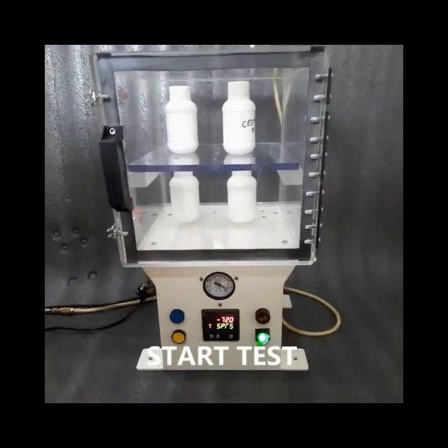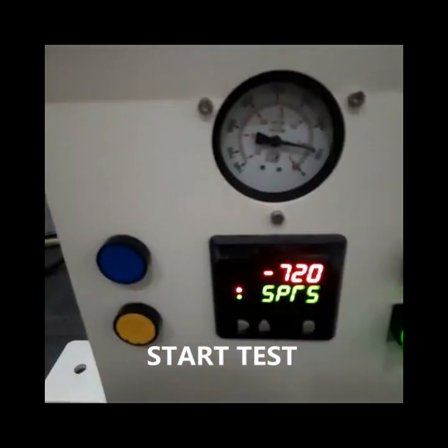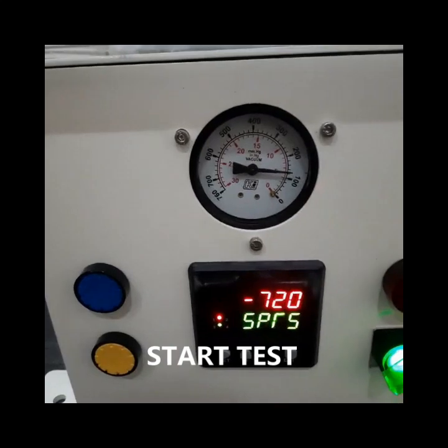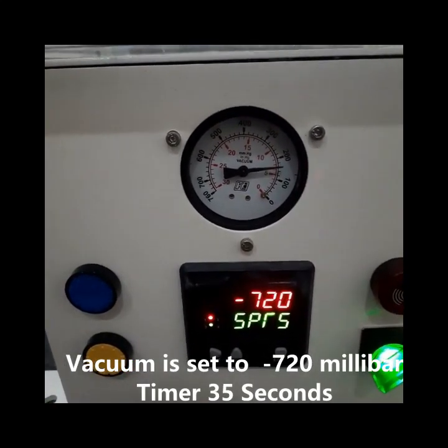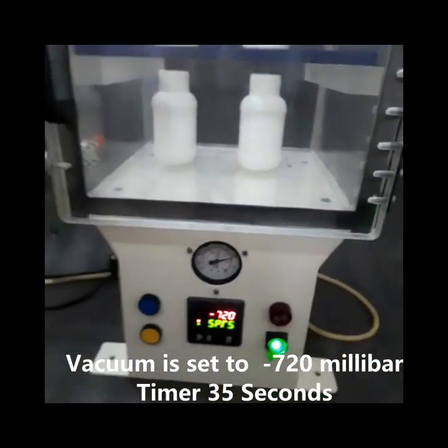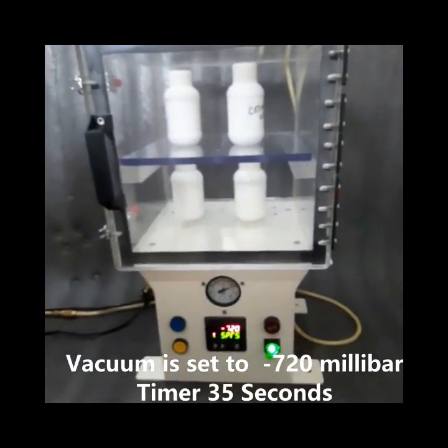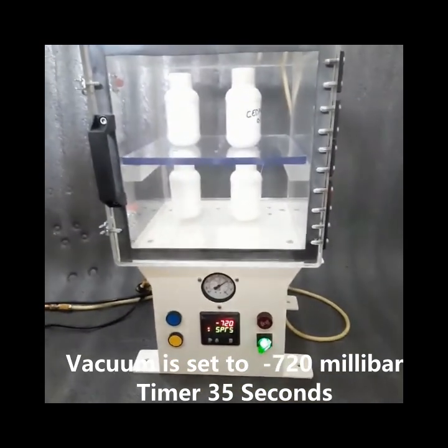Now start the test by pressing the green button. The vacuum is set to minus 720 mbar and the timer is set to 35 seconds. The vacuum process has started, indicated by a buzzer sound.